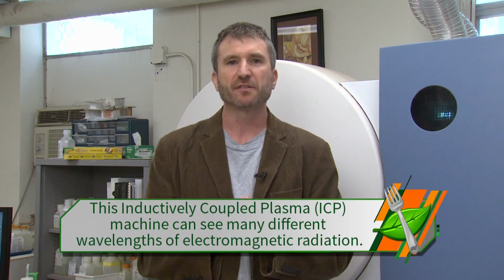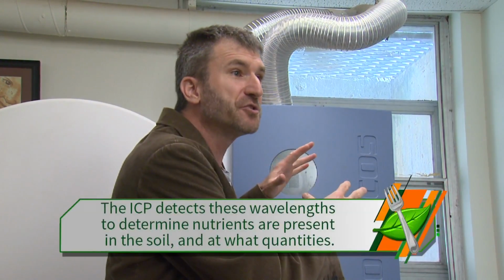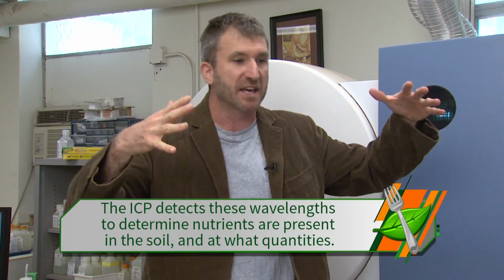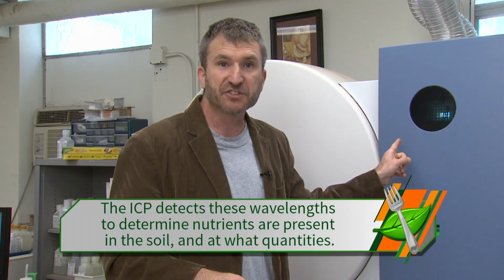Now back to this machine. Remember, we cannot see most wavelengths of electromagnetic radiation, but this machine can see a lot of things that we can't. So when it burns those nutrients, the electrons expand and then collapse, and when they release electromagnetic radiation of a particular wavelength, this will detect it. If calcium releases its wavelength, it can detect from that wavelength that calcium is there and how much calcium is there. When phosphorus emits its wavelength, it can detect that phosphorus is there and also how much phosphorus is there. And so from this amazing technology, you get a wealth of information about the nutrient content of the soils.